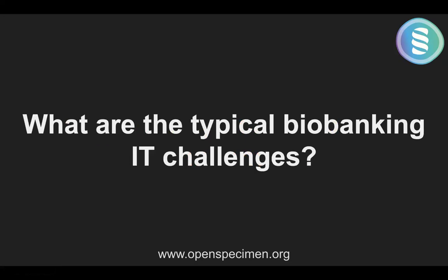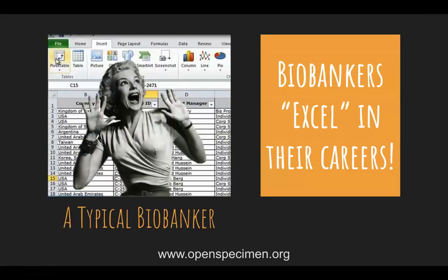So, going back to OpenSpecimen, since many of you are either new users of OpenSpecimen or looking at adopting it, I wanted to start with the typical challenges, especially when it comes to IT, databases, etc. Most biobanks are using rudimentary tools like Excel sheets or homegrown MS Access databases, or other commercial applications meant more for freezer management, where given a specimen you can find out which freezer or rack it is in.